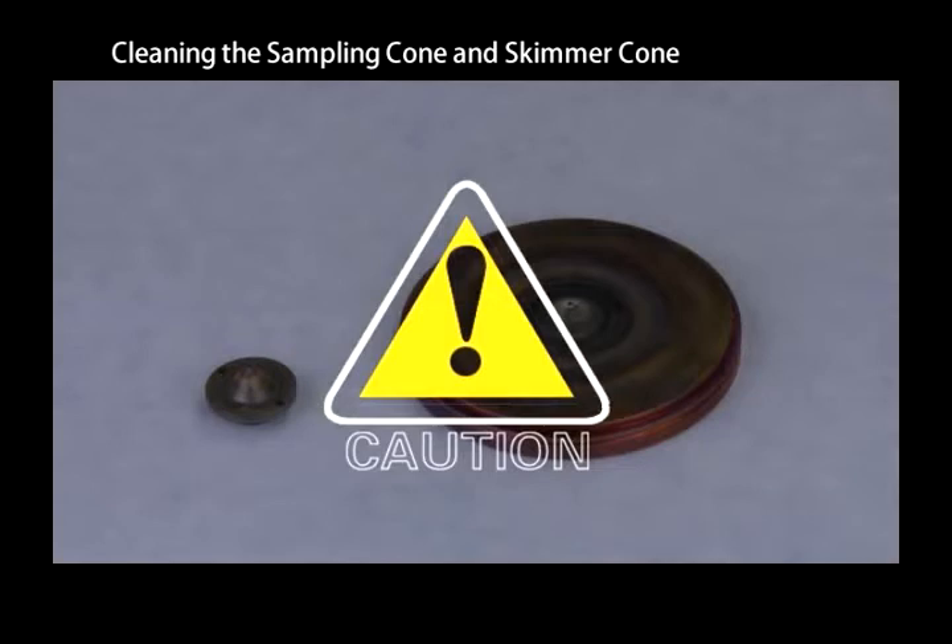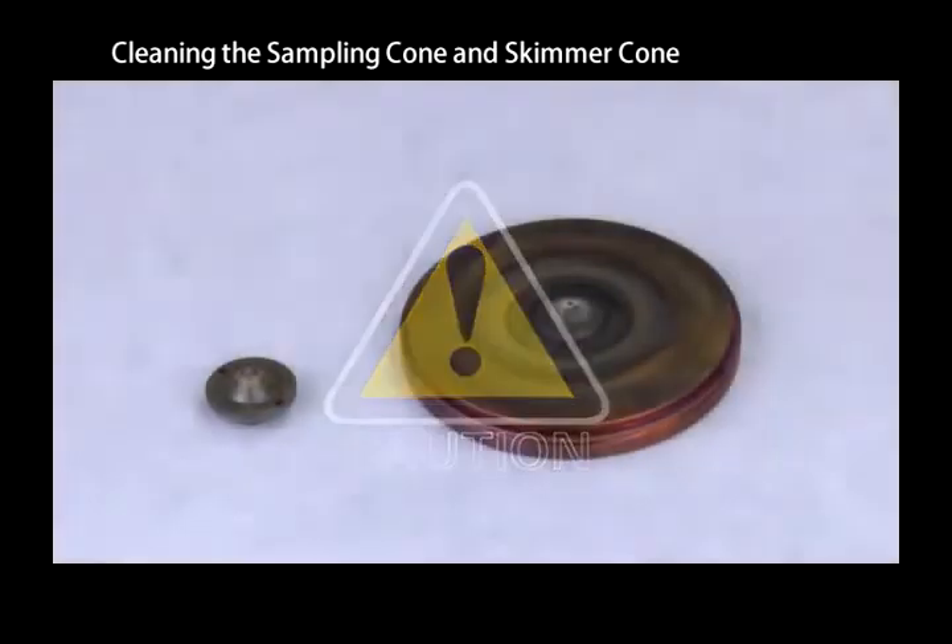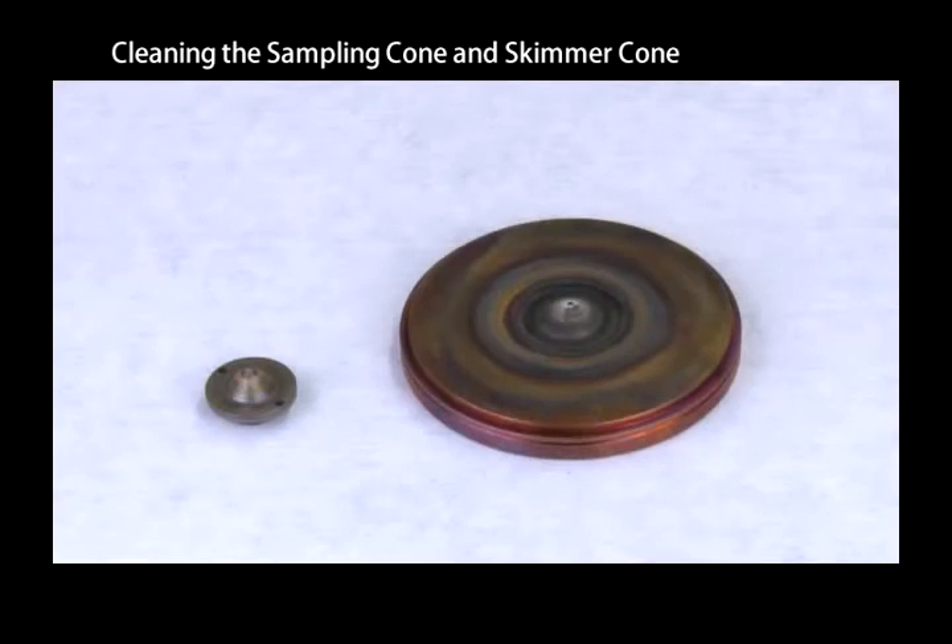Excessive cleaning may also damage the orifices on the sampling and skimmer cones. The following cleaning procedure is made up of four steps. The first two steps should remove normal levels of contamination. Check the background after carrying out the first two steps. If the background hasn't lowered, continue with steps three and four. Do not over-clean the cones, as it will shorten their life.